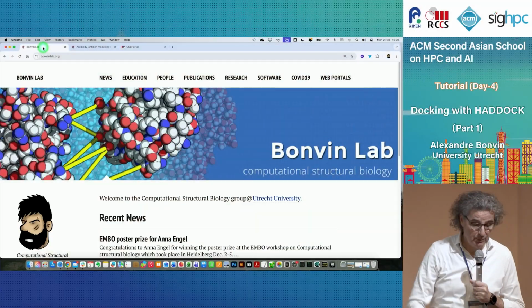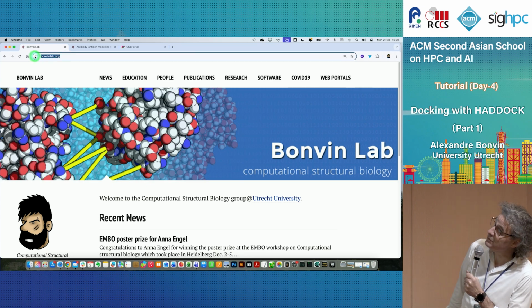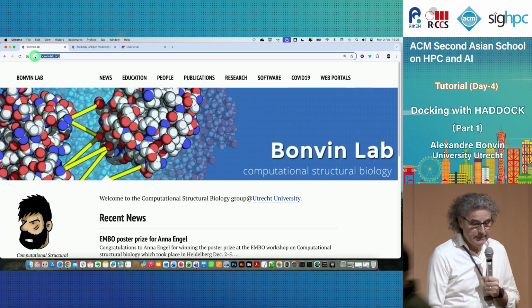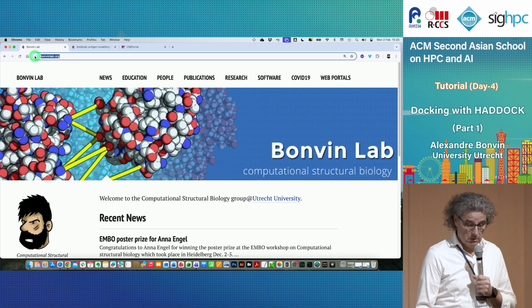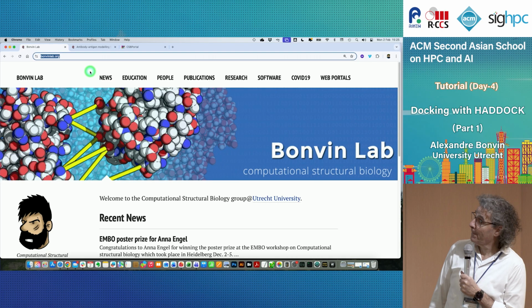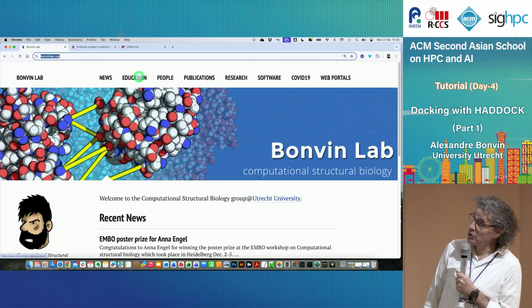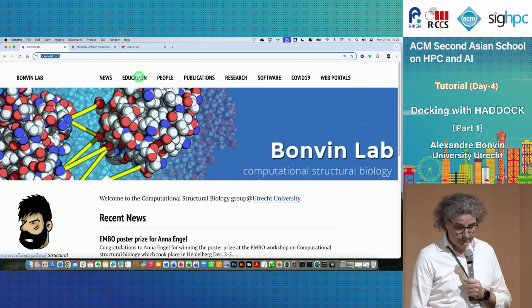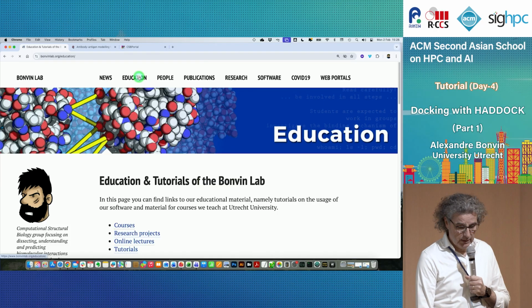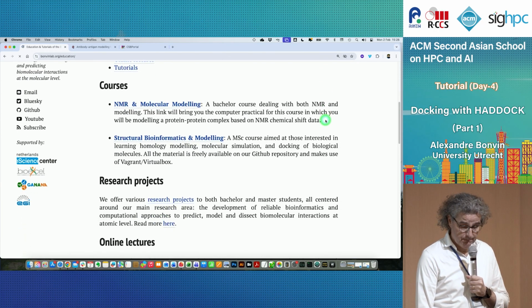If you go to bonvinlab.org, that's the web page of my group. And in that page, there is the education link. If you click there, you will find a lot of different things.